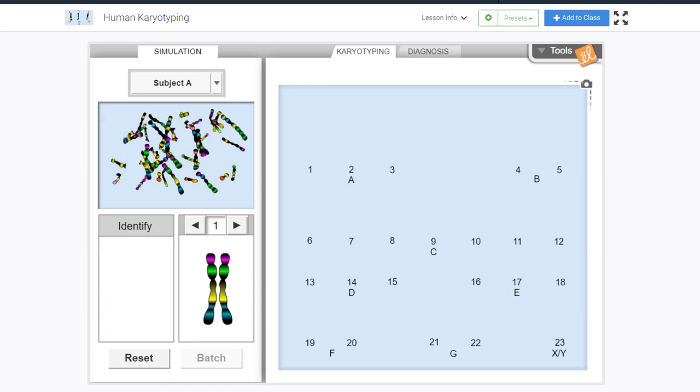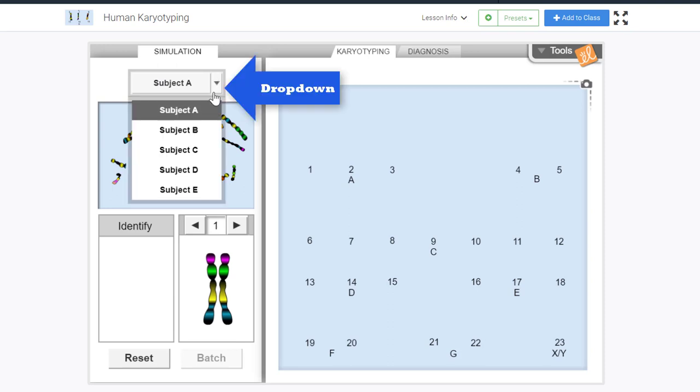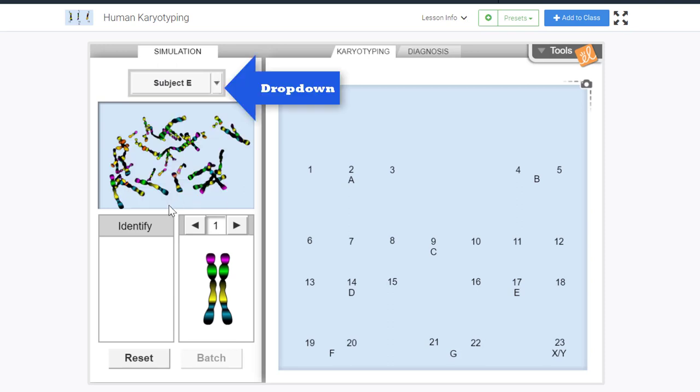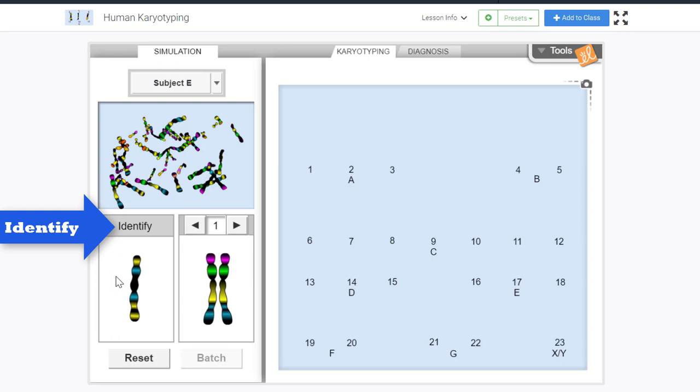Let's take a look to see what the sex chromosomes tell us about subject E. Let's start matching chromosomes and see what we discover. First, we need to change our subject to subject E by clicking on the down arrow on the simulation tab. We can then move our mouse over the chromosomes and select one by clicking on it and dragging the chromosome down to the identify box.